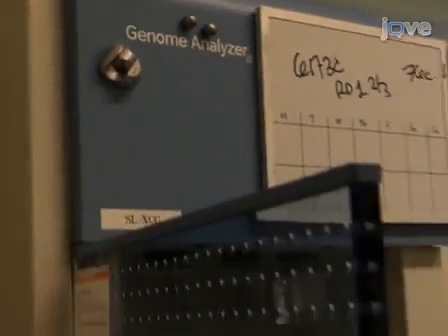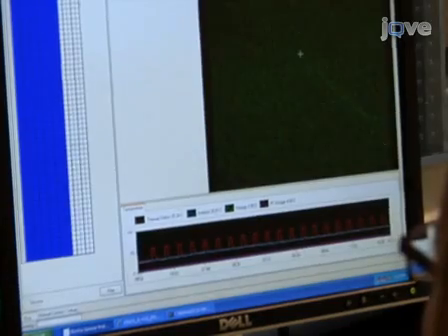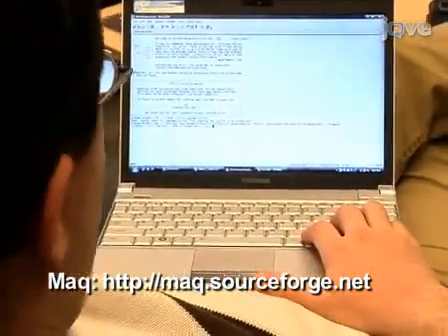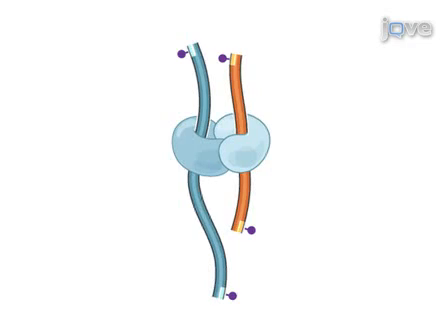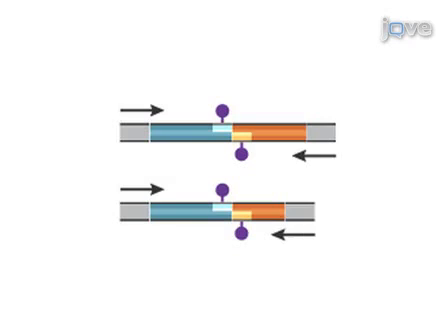Sequence the Hi-C library with Illumina paired end sequencing. Align each end independently using MAQ to identify interacting chromatin fragments. The following results are expected when the Hi-C protocol is executed technically well and can be considered quality control standards.